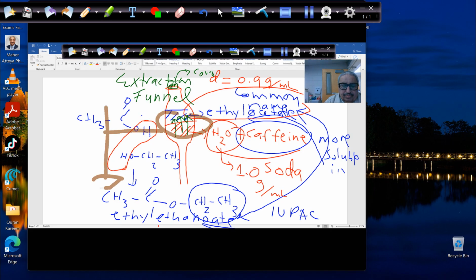So you have to secure this extraction funnel. Let me just explain what will happen. You take this funnel, and you do the whole thing inside the hood. You put the lid on the extraction funnel, you shake it a couple of times, and then carefully straighten up from the shaking, at an angle, not straight. Then you put the extraction funnel inside the O-ring and vent, take the lid slowly off, let it vent and let it settle down a little bit without the lid. So you will see that with shaking, most of the caffeine has diffused into the ethyl acetate layer, the top layer.